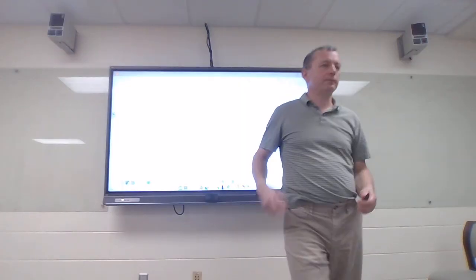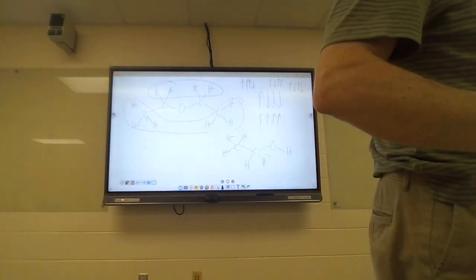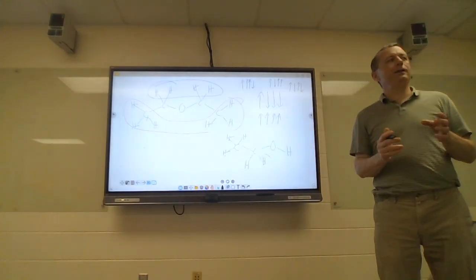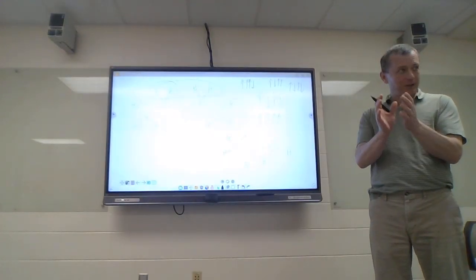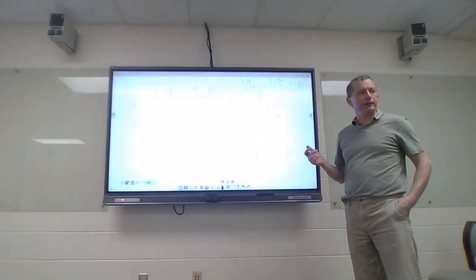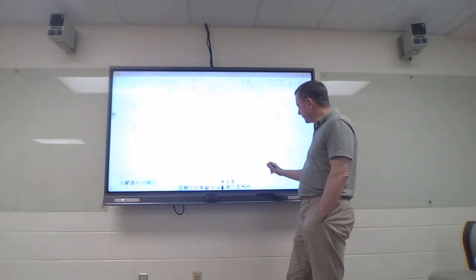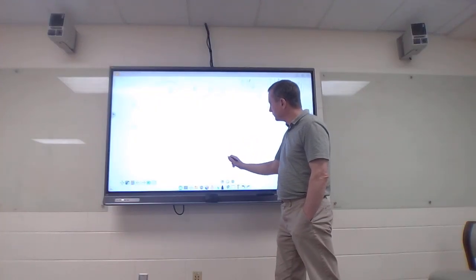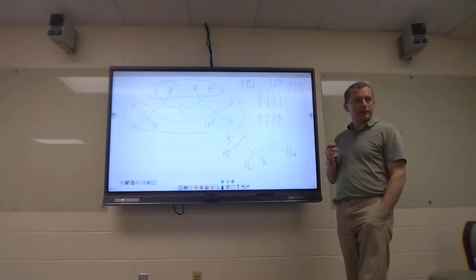Okay? Yeah. Can you do what you did in the first one and like circle which? Oh, when you analyze a spectra, it is good to associate particular hydrogens with particular peaks. And so there's 2 things you could kind of do here. You could number or letter. Some people will call these like HA and those B, and maybe just call this the OH, kind of thing, something like that.